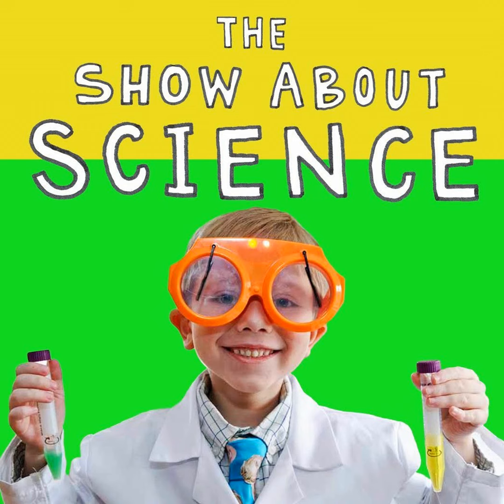But when I take you up there, we'll be able to see a couple things. First, we're going to see a lot of experiments in progress, and you're going to see students working in the lab who are doing science every day. And then we will also see a lot of the instruments that we use to do tests on these materials once we already have made them. So I think we're ready to go up and do some chemistry. Sounds great. So off we went to the lab.